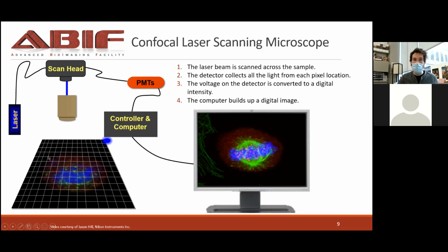You can also decide, I'm going to get a smaller image and only get this top section here of the cell. So you can choose to only scan a 4x4 or an 8x8 or whatever kind of format. So you have a great flexibility for acquiring, and we just want you to get an idea of how you can use this well, for the better, to get better images depending on what you need to see. So we'll go through a few cartoon case scenarios and then a few examples of what this would look like on an image. And this is really just to get used to the geometry of confocal scanning.